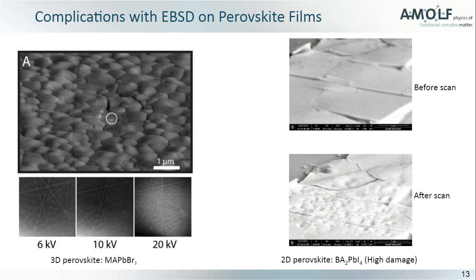And every time we measure it, we can see this damage. You can see it on the right side, the lower right part of this slide. After the scanning, we always end up with these pits, this damage on the film. This is all from scanning, and we tried different currents and voltages, but they all didn't work.